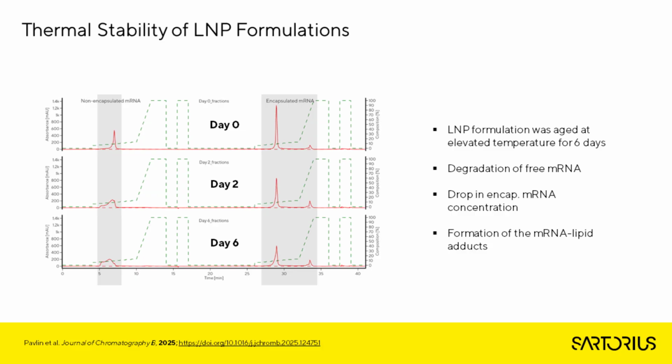Here I have another interesting example of how this method can be used, for example, for thermal stability assessment of your LNP formulation. What we did, we aged an LNP sample at elevated temperature for 6 days.